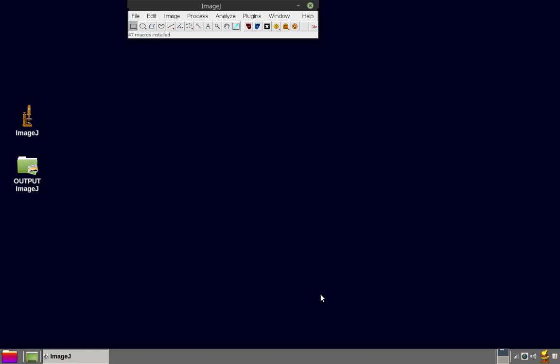Note that deleting logins does not delete folders, so the typo login is still in the output folder. Let's delete that folder.